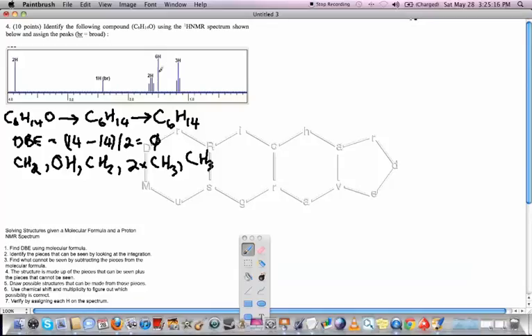And what's important also about this 6H is that it's two CH3s, and these two CH3s must be related by symmetry. If they weren't related by symmetry, there's no way they'd be under the same peak. So we'll get to that in a minute, and we'll see how that applies to the structure.